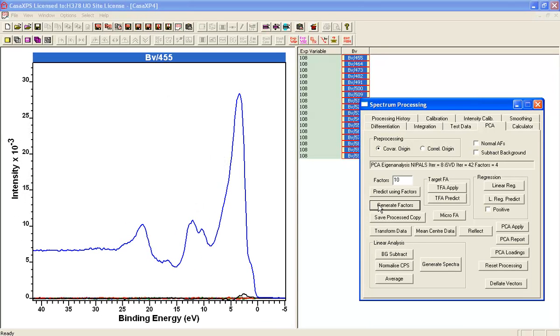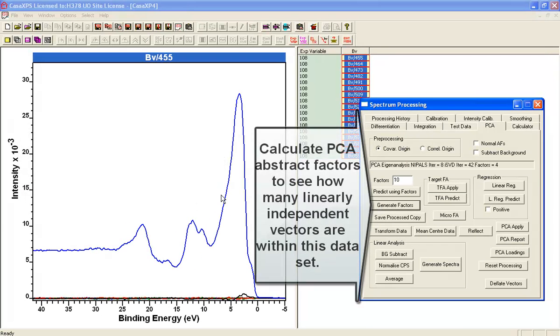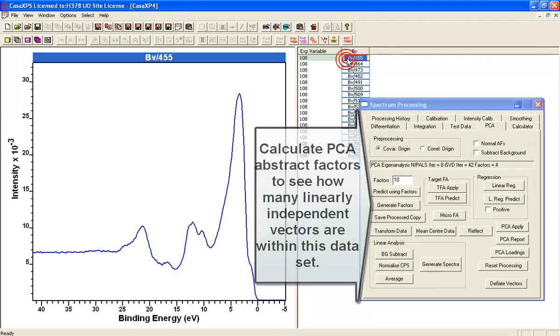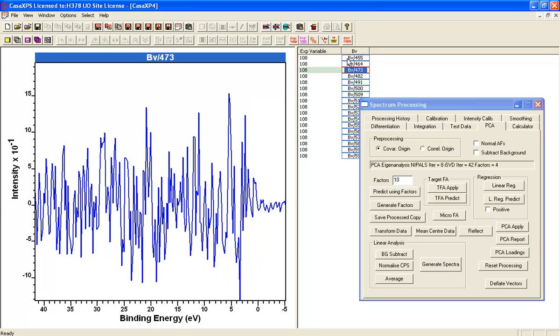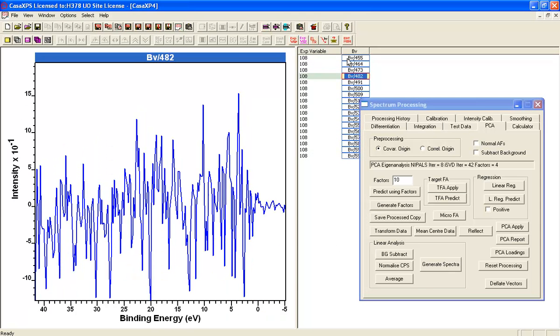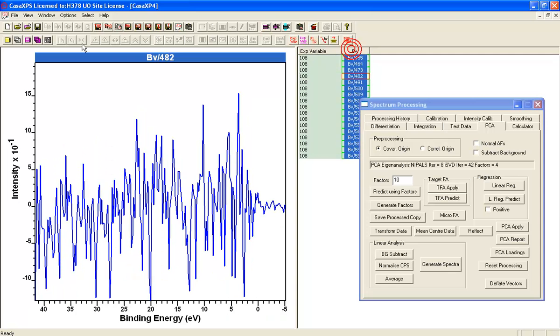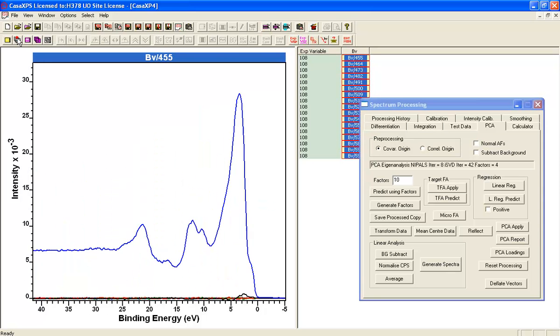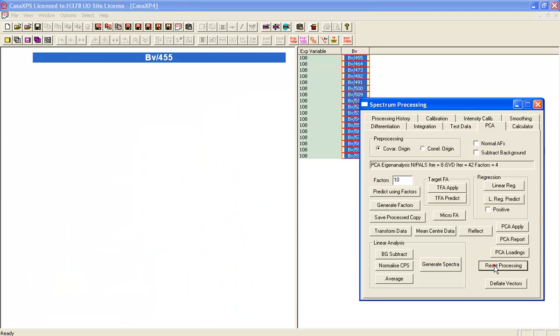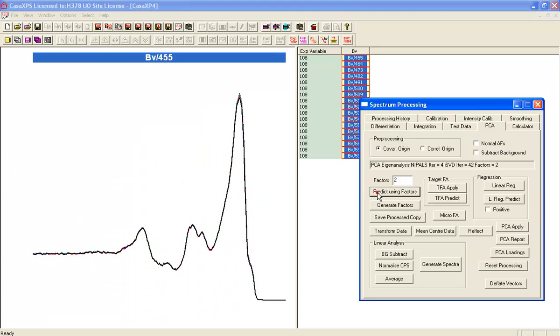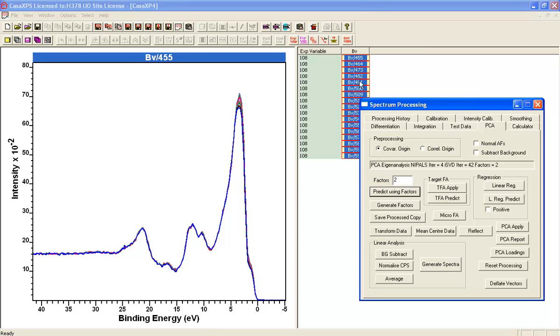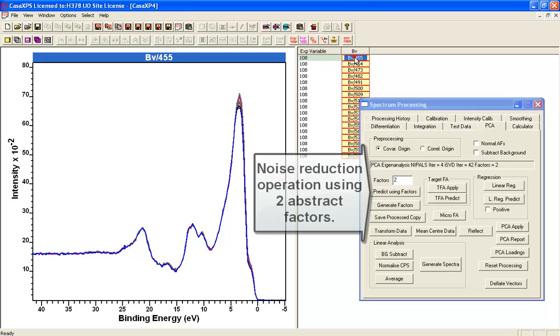Having done that, what we'll do is use PCA to make sure that there really are only two forms, two shapes within these data, and that's what PCA is telling us. We will use two abstract factors to reproduce these data in an attempt to remove noise.